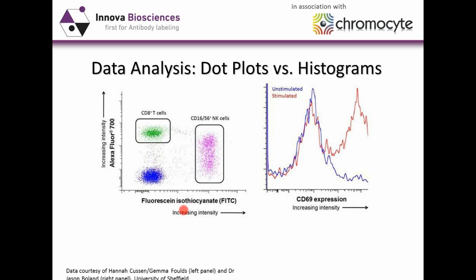And for example, you could put a region around this and then analyze those cells, the phenotype of those cells in more detail through a various hierarchical system.